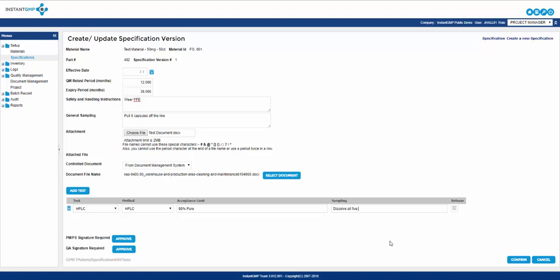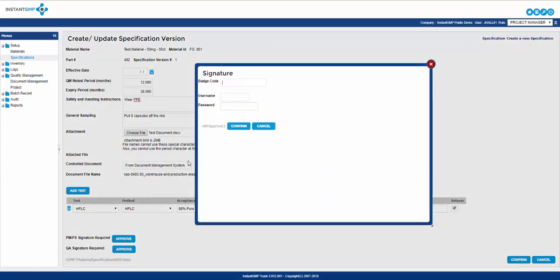Acceptance limit is where you can enter the acceptance criteria for a passing result. Sampling is the section where you will enter the amount you will sample from the general sampling plan. The final box is simply a check box in which you can select if this test will be used for release of the product. After all this information is entered the final steps are to sign off on the specification which requires a project manager or project supervisor along with a QA signature.